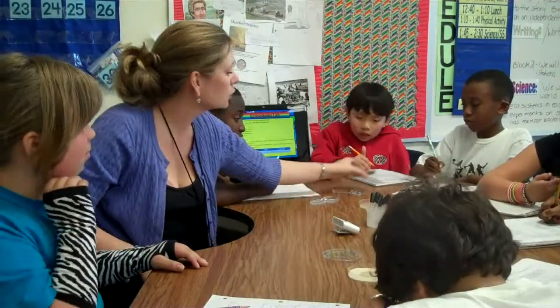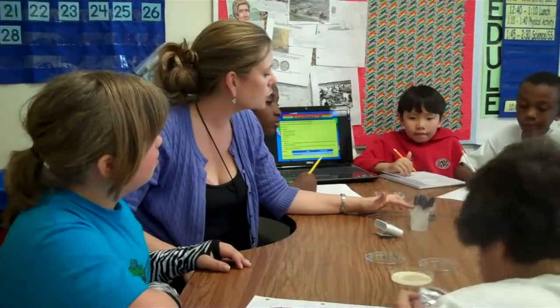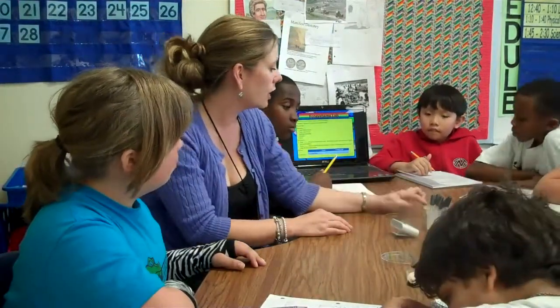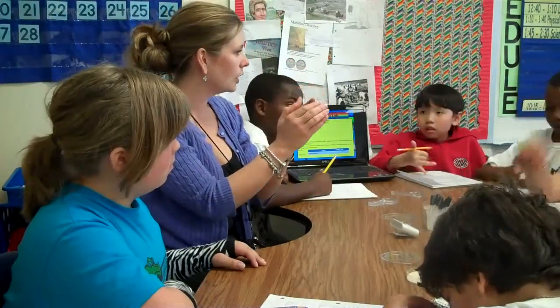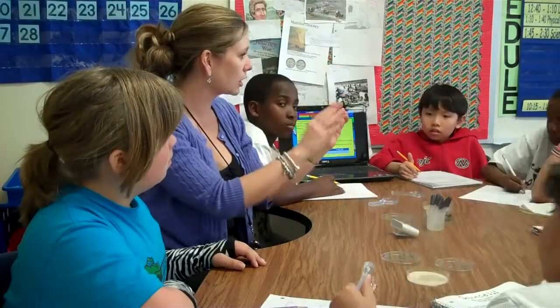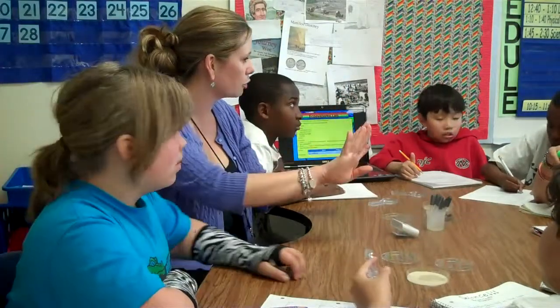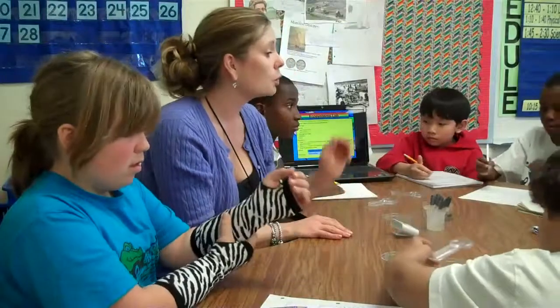I did a little research last night. I found out that when peroxide touches a certain substance that's either on your skin or in the soil, peroxide is H2O2, and when it hits that surface, it changes into water plus oxygen, O2. So it comes out to be H2O and then oxygen. It sort of separates the whole molecule up, and that's why you see the reaction there. All right, write in your results.